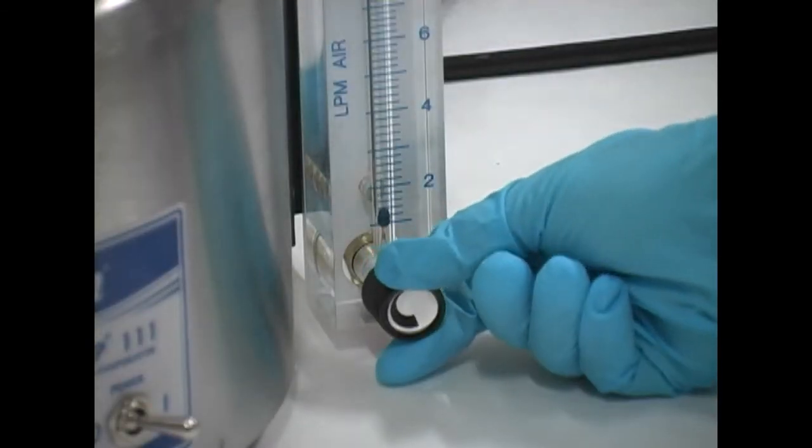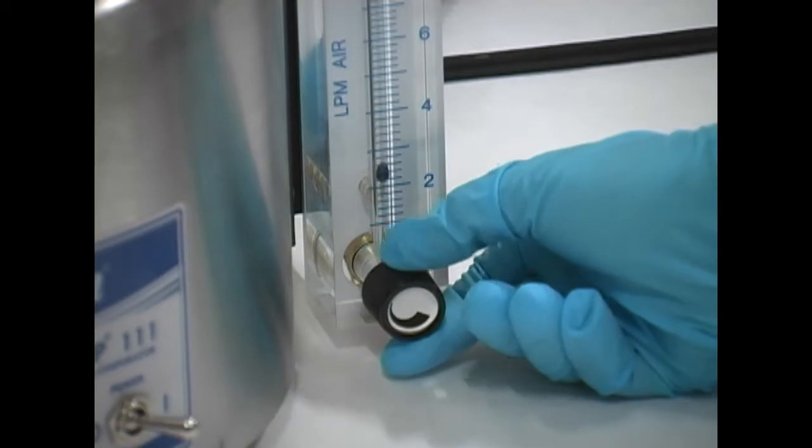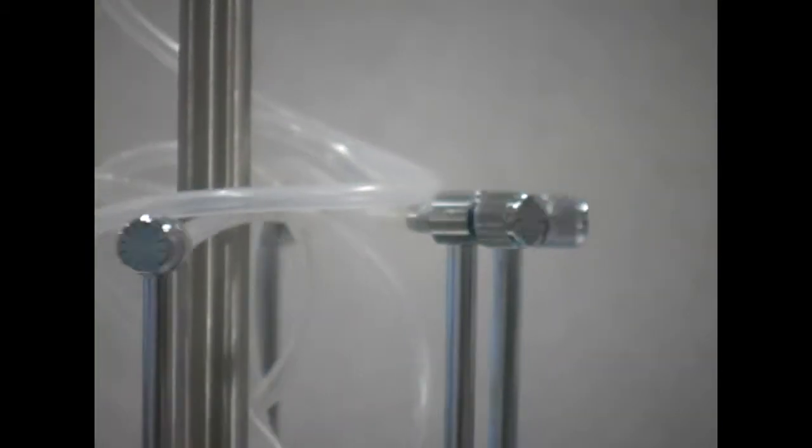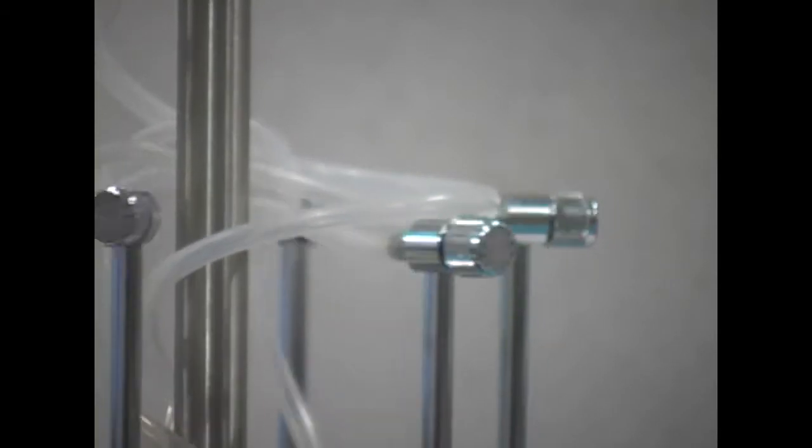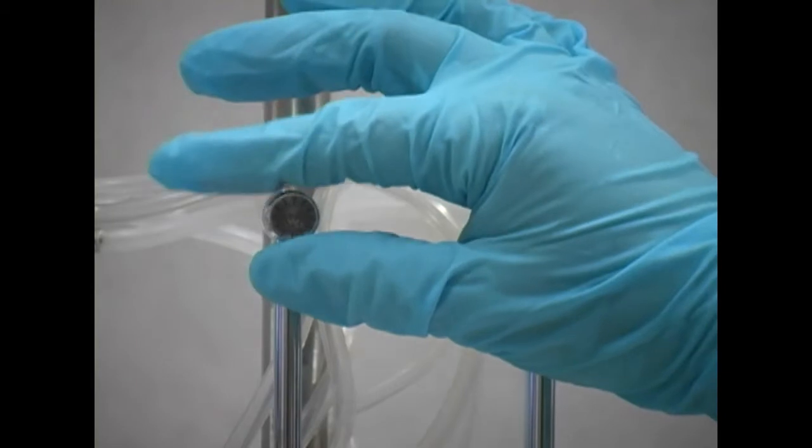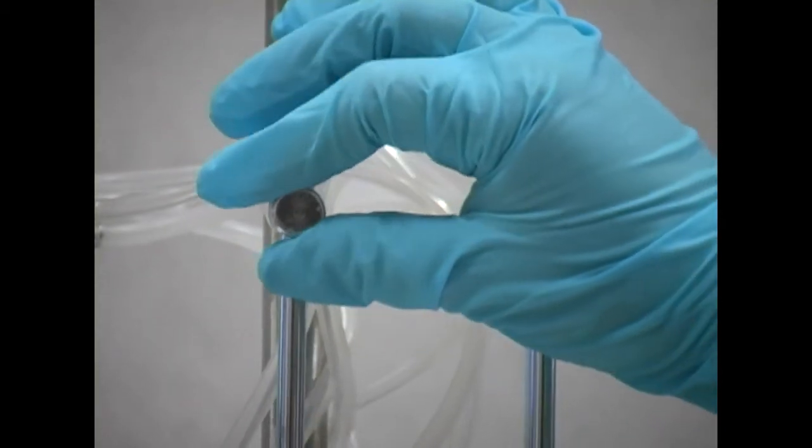Once samples have been loaded, the flow meter allows the user to easily adjust the flow of nitrogen entering the system. The user is in full control of the nitrogen flow delivered to each sample with our chrome-plated needle valves. Each valve rotates to allow the perfect amount of nitrogen flow to diverse samples.